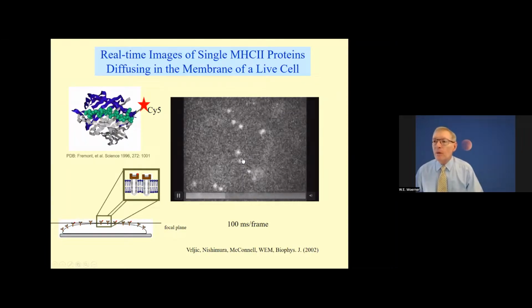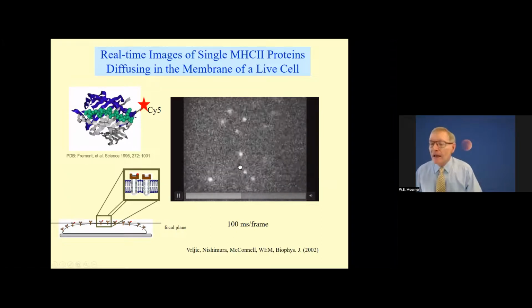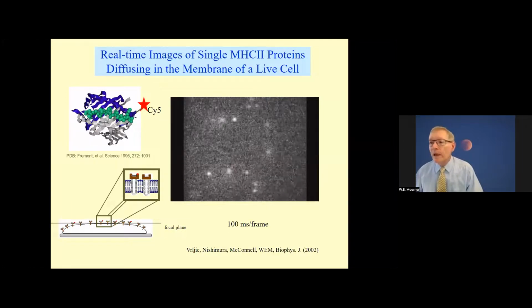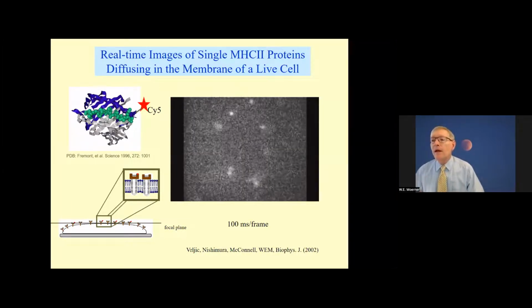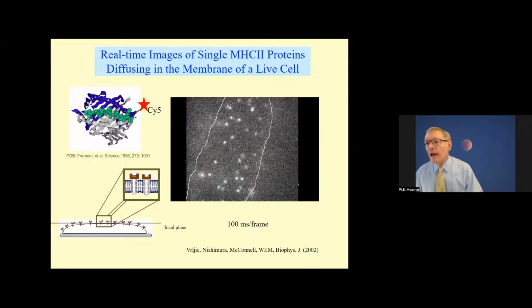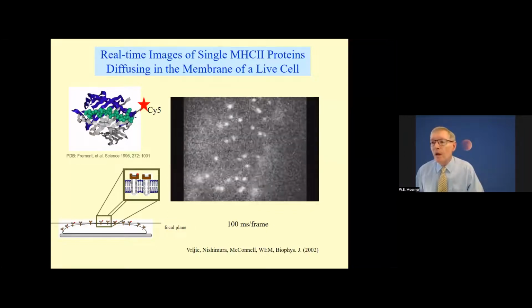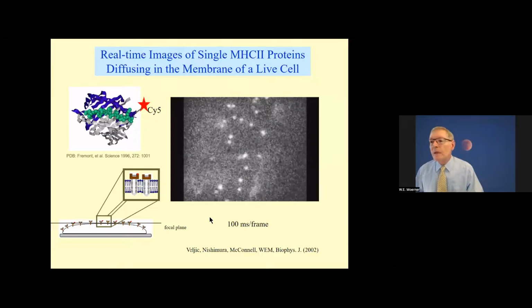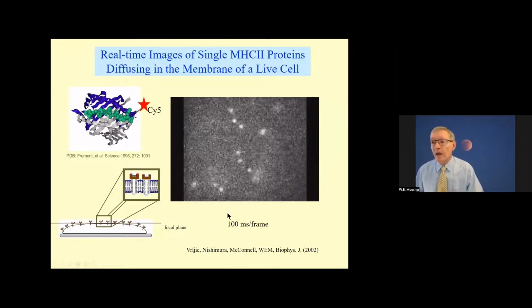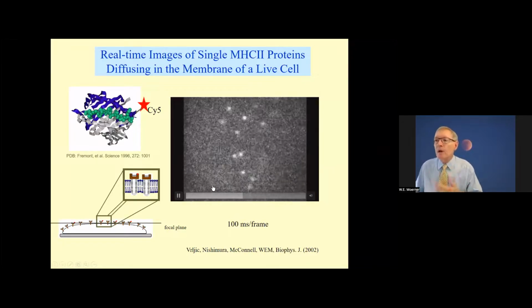You also see the molecules disappearing, turning off. Now, what is that? That turns out to be photobleaching. That turns out to be when the fluorescent molecule has given so many photons that it finally is going to give up, maybe change a bond or something like that. And this process is the same as the process that you pay for when you buy blue jeans, but you pay someone to bleach them so that they're not blue, but they're white, not absorbing anymore. Many, many molecules will photobleach ultimately, almost all.